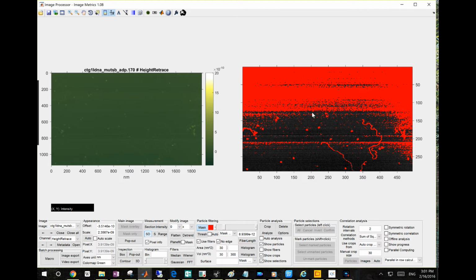As you see, the mask will tell you what order you want to flatten the image. The 0 order is just to make them roughly the same level, so that you can see better what approach you should ultimately take to make the image truly flat.